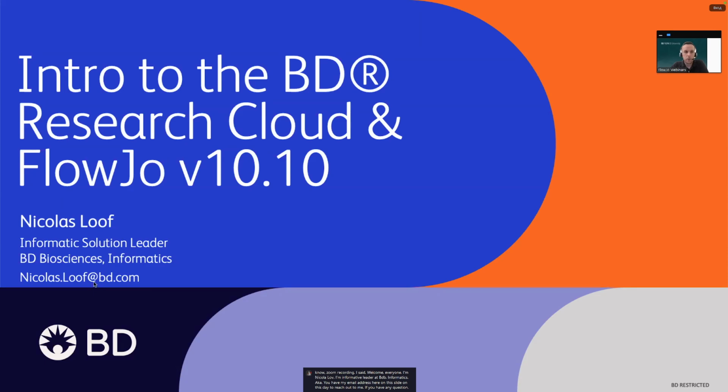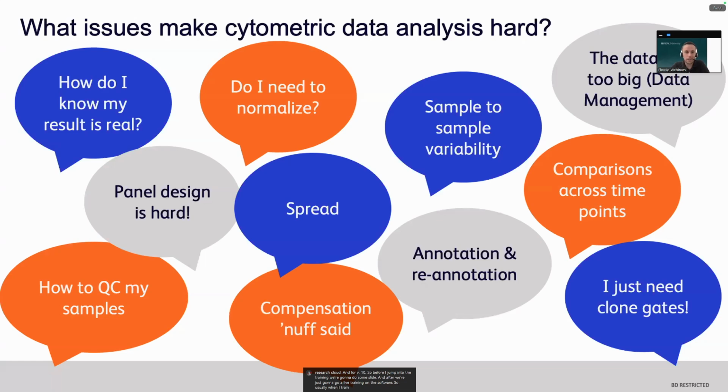So for today's webinar, we're gonna talk about the BD Research Cloud and FlowJo V10. Before I jump into the training, we're gonna do some slides, and after we're just gonna go into a live training on the software.